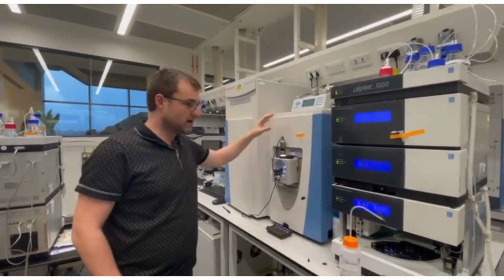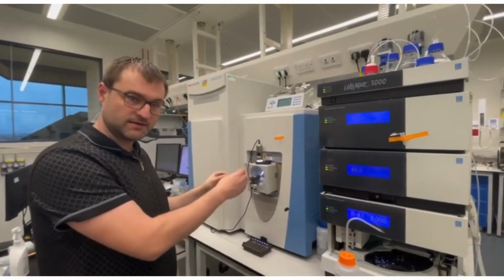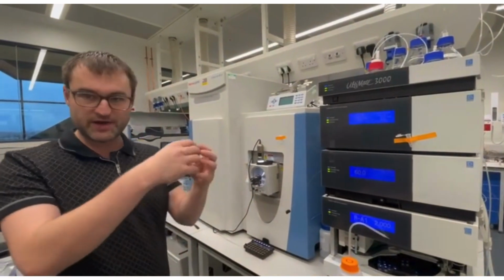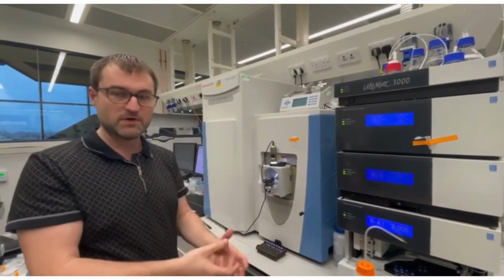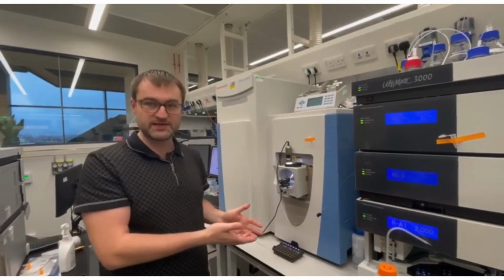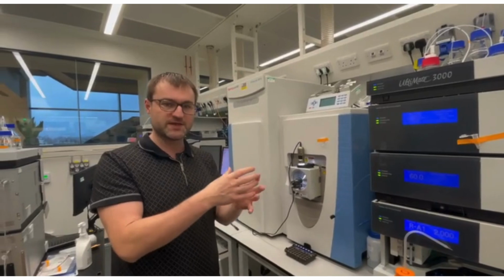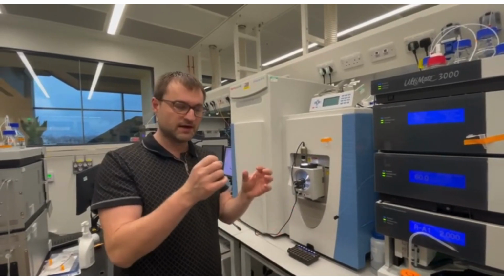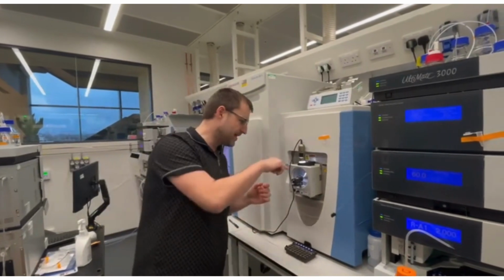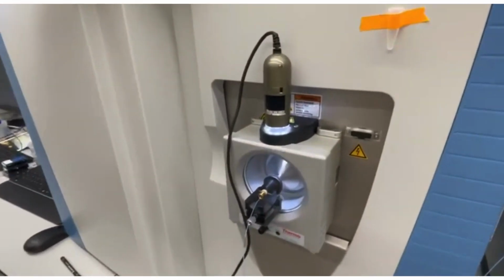So how do we convert peptides dissolved in liquid into separate ions in vacuum? Well, we have this thing called an ionization source, electrospray ionization. As peptides elute, they get into droplets. These droplets become smaller and smaller, they break down and evaporate, and finally we have individual peptides that fly into this hole here. And inside this device, we have vacuum.